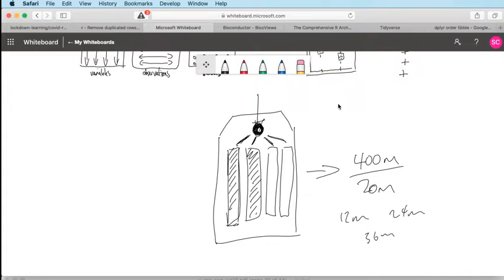And this library depth is the thing that is the biggest influence then on the sequencing depth at any given gene. So if we've got a gene that we've sequenced and we have reads that align to that gene in our experiment.